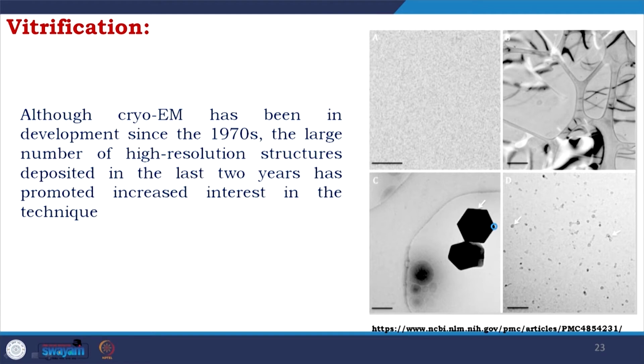As you see here, good vitrification happened. Here you see the presence of crystals. Here you clearly see the hexagonal crystal impurity or contaminant. Here you see the dots, these are the formation of a kind of non-homogeneous condition.